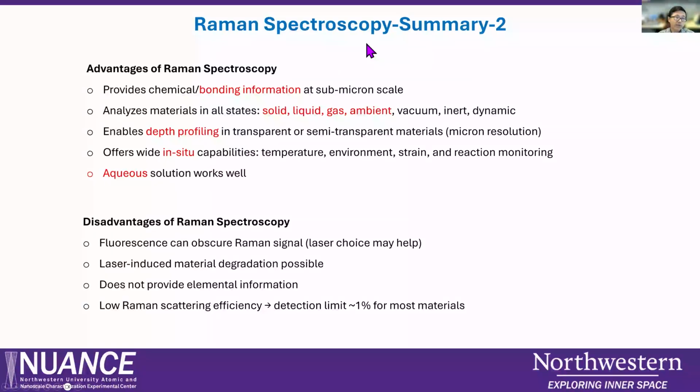So for Raman spectroscopy, the advantages are that it can provide chemical bonding information and analyze solids, liquids, and gases. They can do depth profiling, and they offer in situ capability, like temperature and environment changes. Especially, Raman works for aqueous solutions, but for IR, a water solution is very challenging.